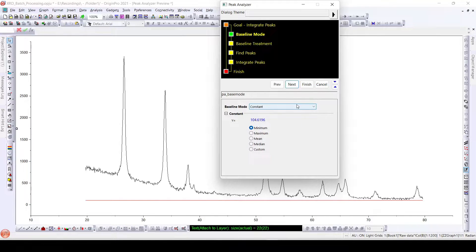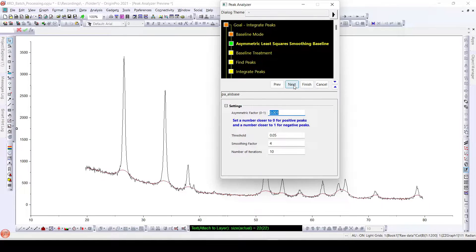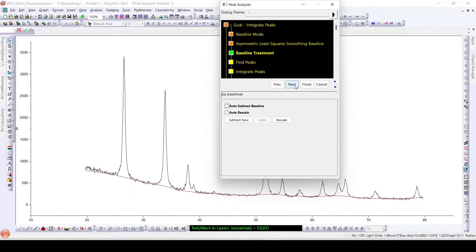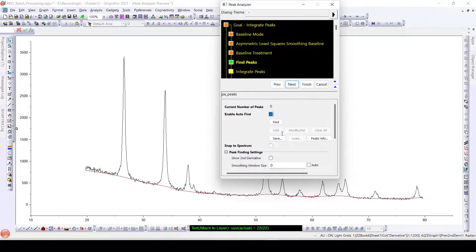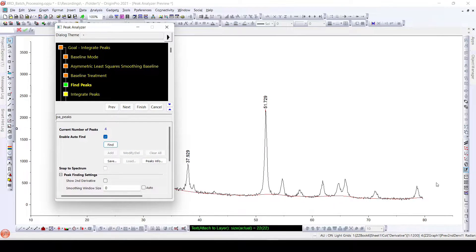Next, here we will set a baseline. We will select Asymmetric, and select the appropriate baseline for this particular pattern. We then click Find Peaks, but we can see that not all the peaks are selected in this XRD pattern.